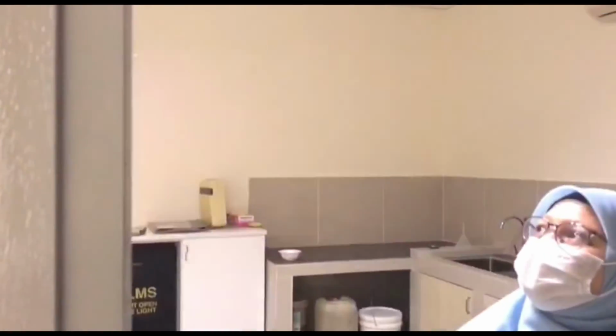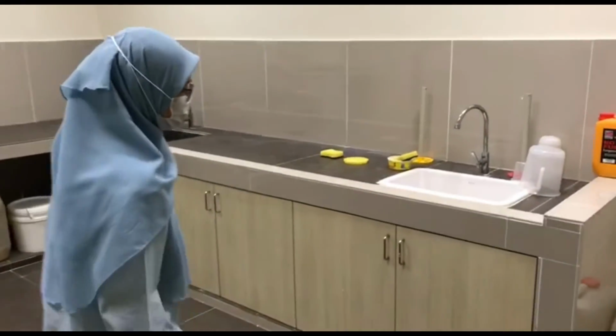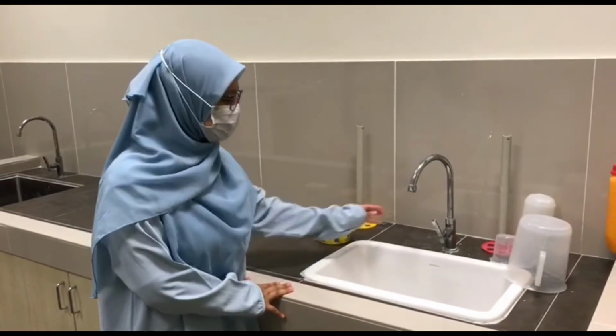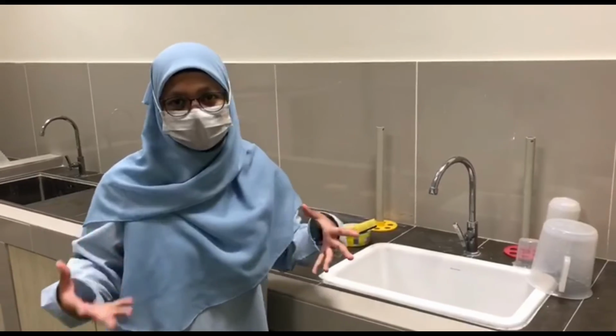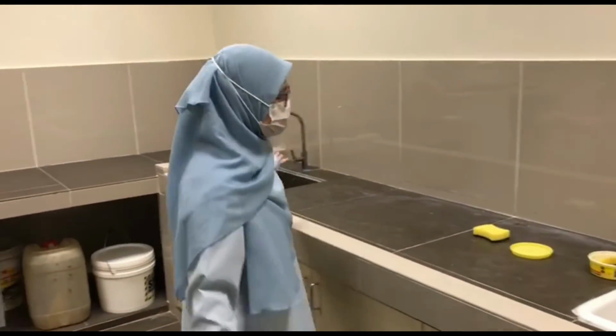So firstly, we will open the light. Okay, come inside. So the first thing that we have is the sink. So we can use it to wash our hands or any of our body parts when we use chemical. Okay. Then this is another sink.